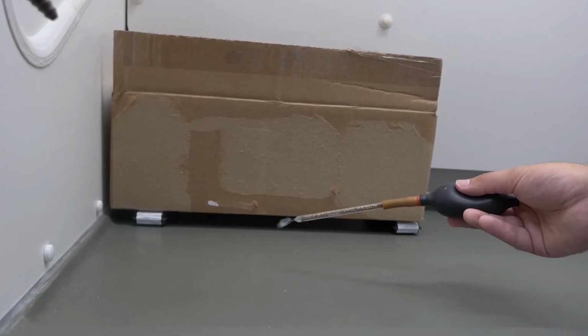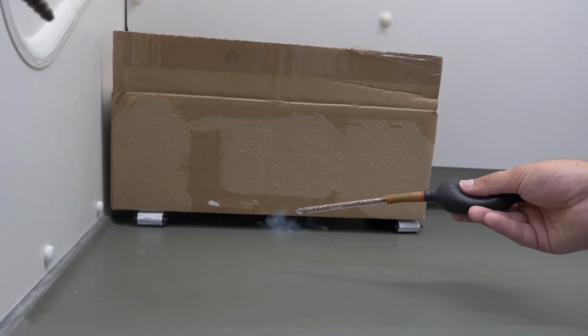Lastly, the fume hood pulls air through openings in the back called baffles. Don't block the baffles because it creates uneven air currents and poor capture. You can elevate equipment by an inch to allow air to pass under and back to the baffles. Using shelving in the back will also help prevent blocking the bottom baffles.